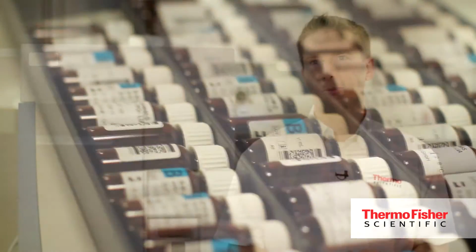Therefore, the United States Pharmacopeia decided to redo this chapter, and the outcome was two additional chapters: 232, which sets limits for different elemental impurities present in drug products, and chapter 233, which describes two analytical methods to analyze for elemental impurities. One of them is ICP-OES, which is explicitly mentioned in that chapter. The other one is ICP-MS.